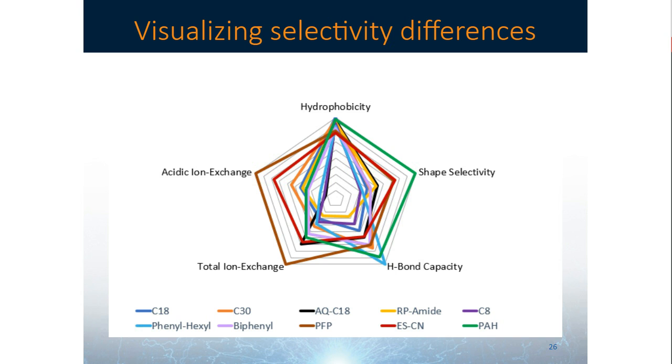There are some method optimization packages where you could possibly model the mixing for you. But if you don't have access to that, I would just say, if you're noticing that acetonitrile isn't giving you the selectivity that you need, and methanol isn't doing the job either, then I would say it would be a good idea to try mixing them.